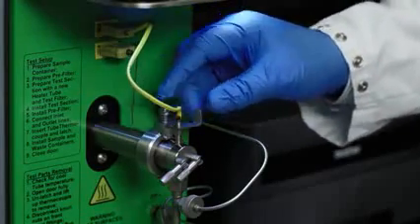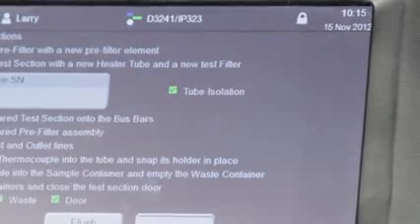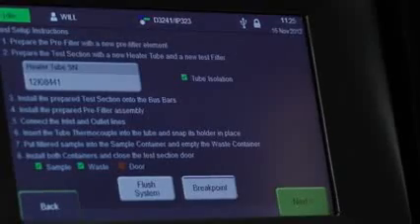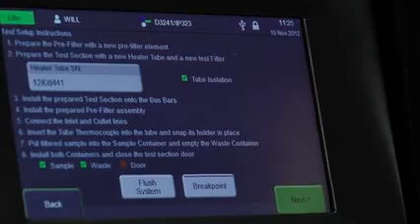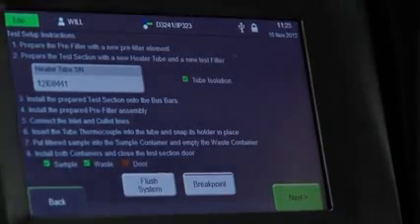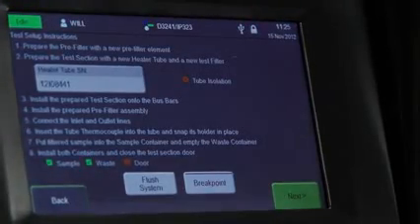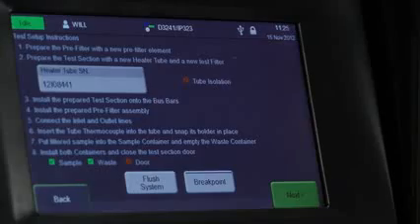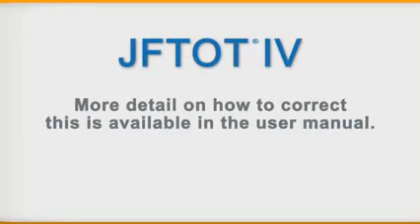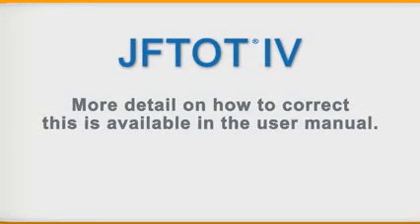Insert the heater tube thermocouple completely into the hole in the top of the heater tube and slide the holder over to hold the thermocouple in place. Check the status of the tube isolation. If there is an electrical short between the heater tube and test section, you'll be able to see this on the screen. If you see this indicator, you'll need to correct it before moving to the next step. More detail on how to correct this is available in the user manual.